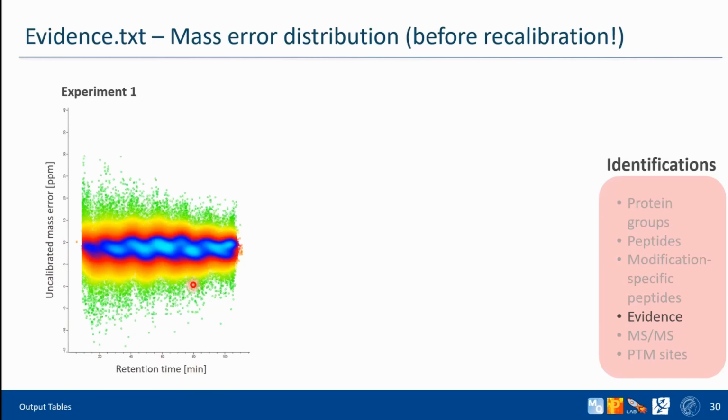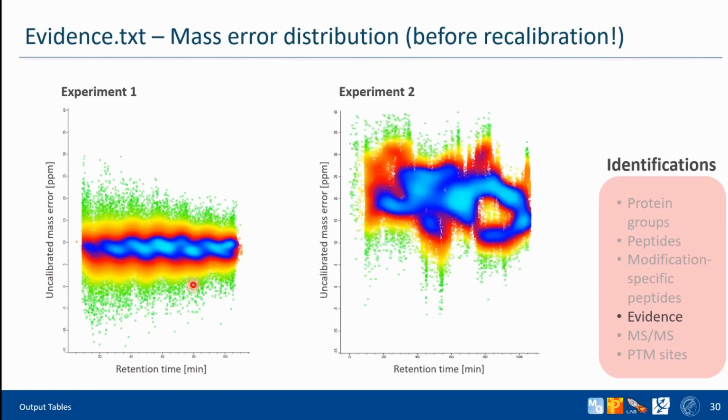So we can say that this could be a reliable mass error distribution, but we may also have something like that. And here something really bad happened during the mass spectrometer run. Maybe a batch effect. Maybe one day the mass spectrometer was doing something really wrong, an error, or I don't know, you just opened the door while you were running it, and that completely skewed the results. If you use the mass spectrometer, you definitely know more than me, because I never used one, but you probably know how many factors can impact that.